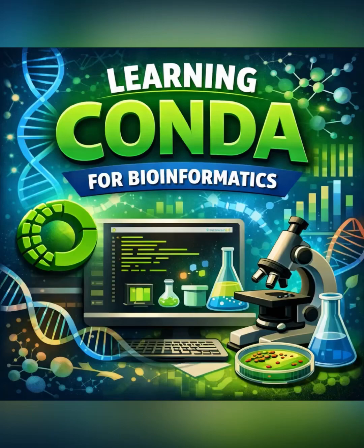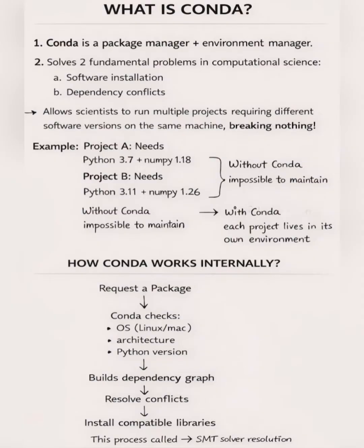Hello everyone. In this video, I'll show you how to install FastQC, create and activate our conda environment, verify that FastQC is working, and finally run FastQC on a sample FastQ.gz file. On this page, I'm explaining what conda is and how it works internally, especially for computational biology and bioinformatics workflows.